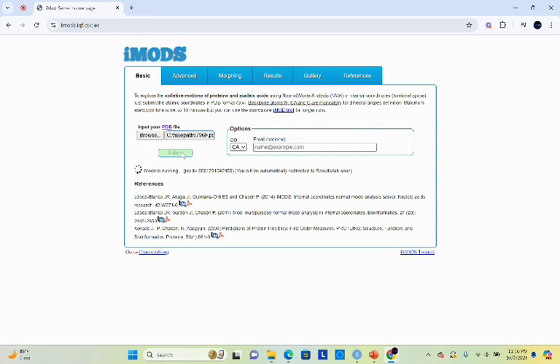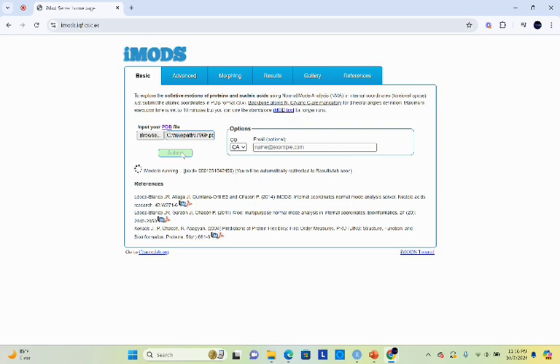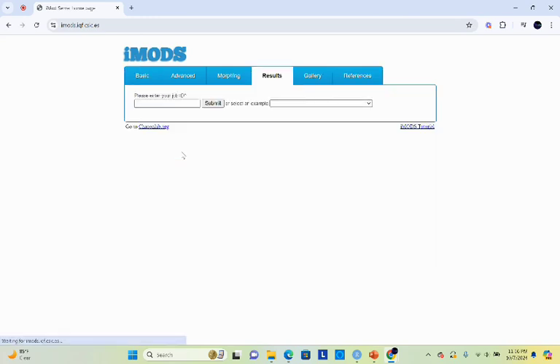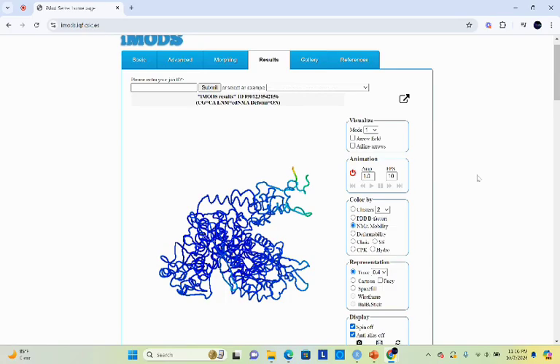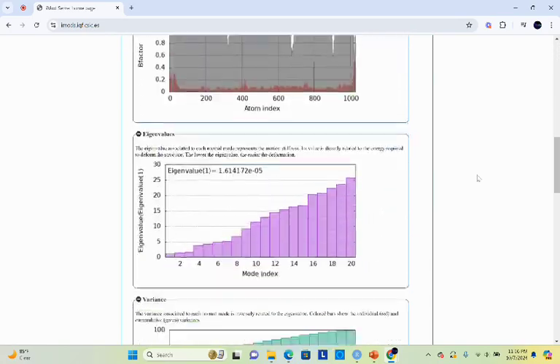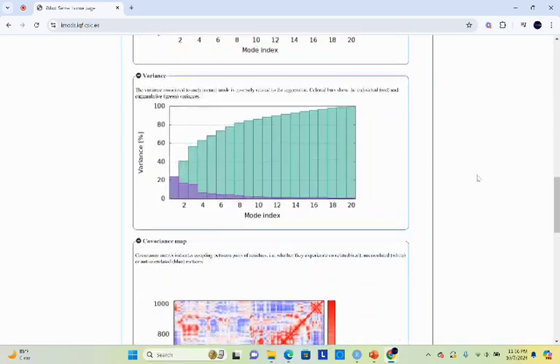When you run the molecular dynamics simulation using iMode, iMode will give you results in the form of different graphs. iMode will give you B factor mobility graph, eigenvalue graph, variance, residue index, and elastic network. Here you can see the result of iMode.